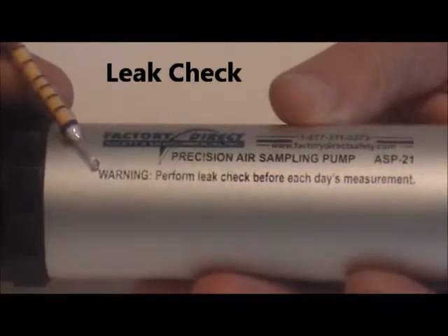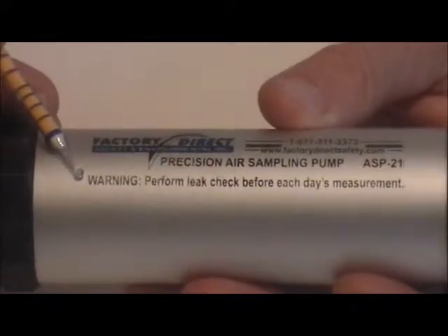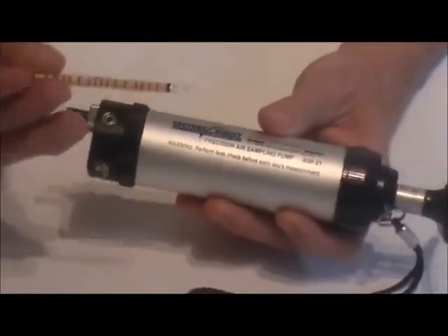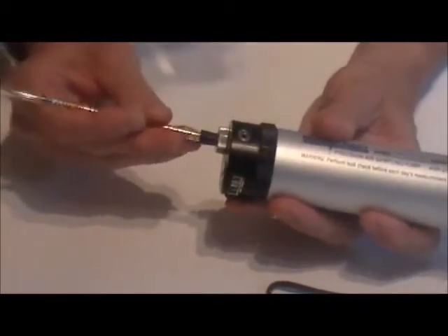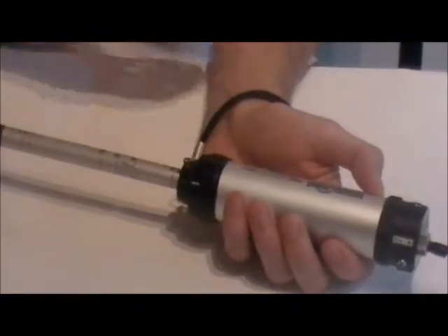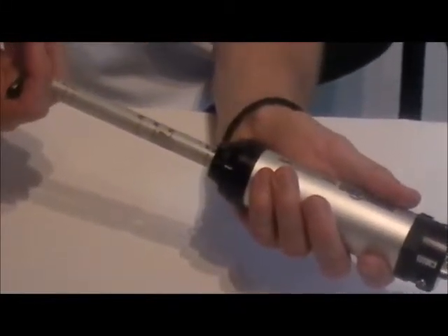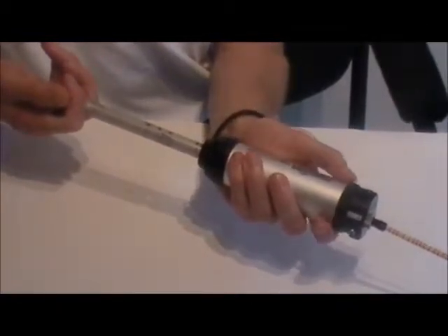For each set of measurements or each day's measurements it's very important to perform a leak check to make sure the pump is working properly and the tubes fit in the inlet correctly. To perform a leak check, insert an unopened tube into the inlet — it must be an unopened tube. Then align the dots, pull one full stroke, and use your stopwatch to measure for two minutes. At the end of the two-minute period, carefully rotate the handle keeping some resistance on it so it doesn't snap back quickly, and allow the pump piston to be drawn back into the pump.